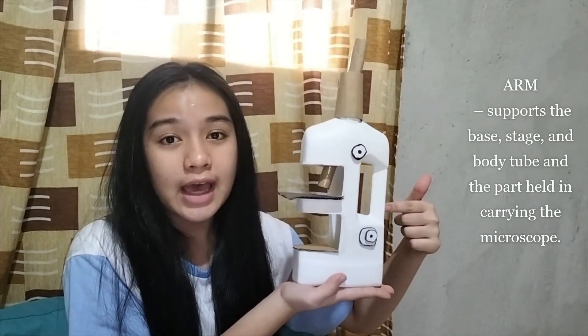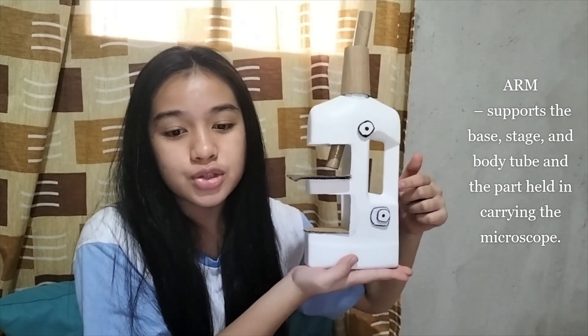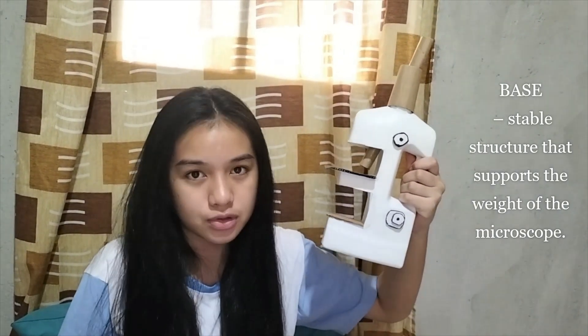Now, what I'm pointing at is the arm. It supports the base, stage, and body tube, and is the part held when carrying the microscope. And finally, we have the base — the stable structure that supports the weight of the microscope.